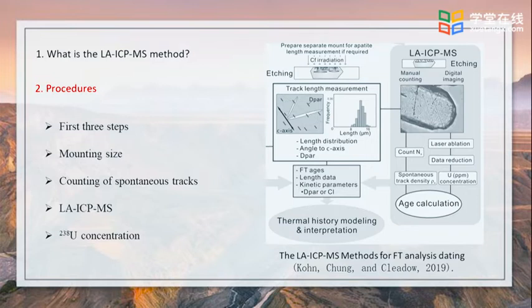Uranium concentration is determined relative to suitable external standards of accurately known and uniform uranium abundance, for example, NIST 610 or NIST 612 glasses, and measurements of appropriate internal standards to correct for variations in ablation volume. These works also list operating conditions, but these are not universal and may vary with specific instrumentation used. Fission track ages based on the ICP MS method are usually calculated as an absolute age using values for all the constants in the age equation.